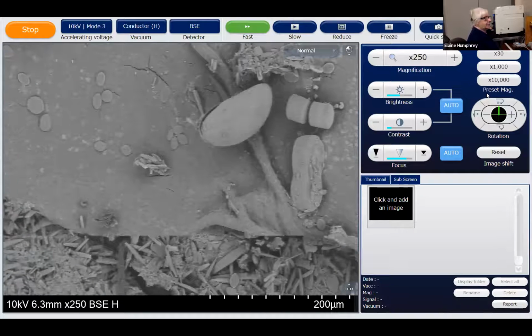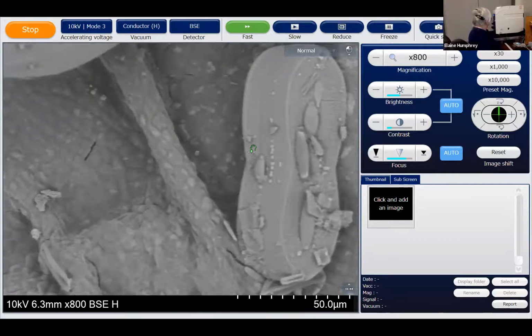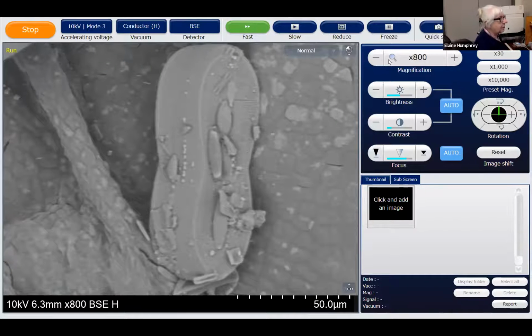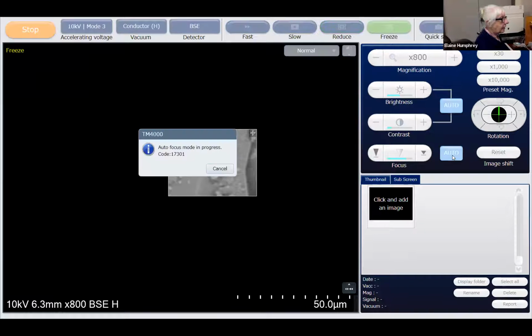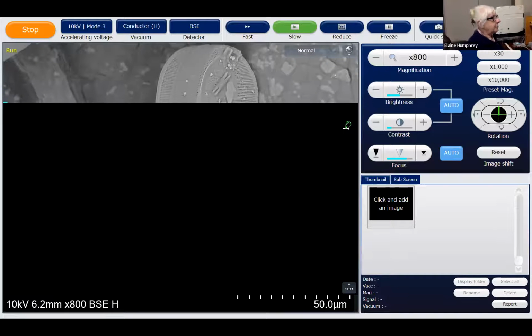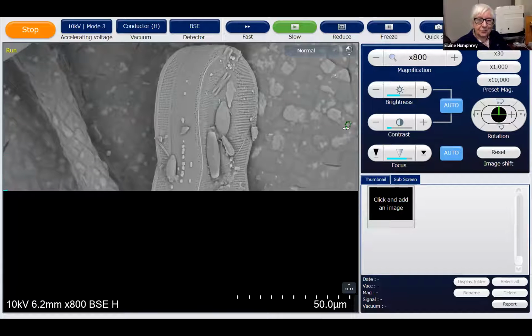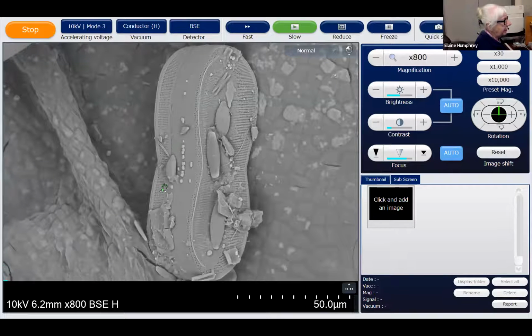And if we look a bit closer at the peanut, you can see it's covered in little diatoms. These little diatoms are called amphoras. So let me use the reduced window here. And it turns out, remember I said that some diatoms can move. That's because they have a slit in the body that oozes out the mucilage. And this is one of the guys that's got this slit. You can't really see it very well here, but the slit is here.